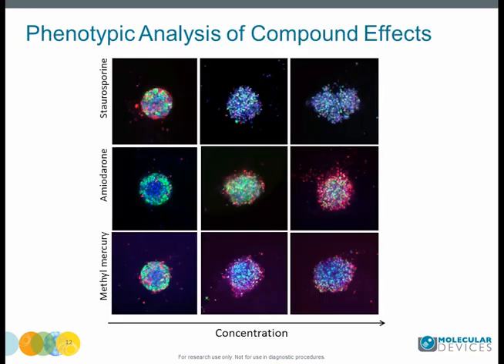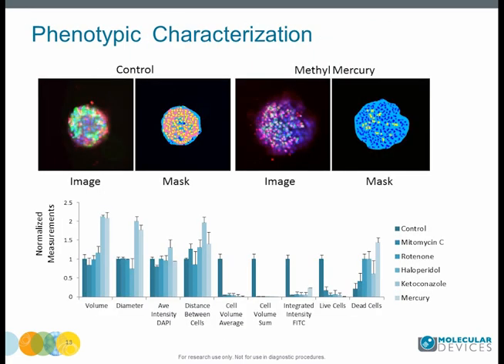Significant changes in spheroid phenotypes and cell content were seen after treatment with hepatotoxic compounds. Many spheroids lose their spherical shape, appear disintegrated, loose, flattened or irregular, have cells detached from the main body, or show condensed nuclei due to cell death. Quantitative analysis of images includes finding parameters that allow assessing morphological features of spheroids and also their content and complexity.